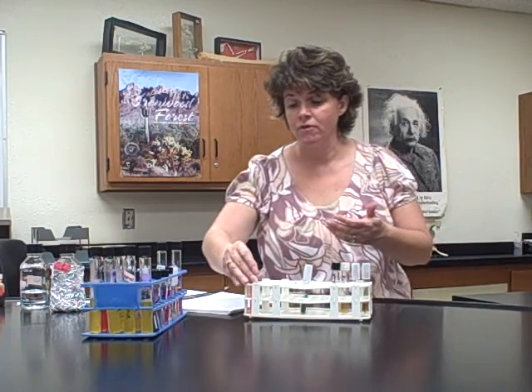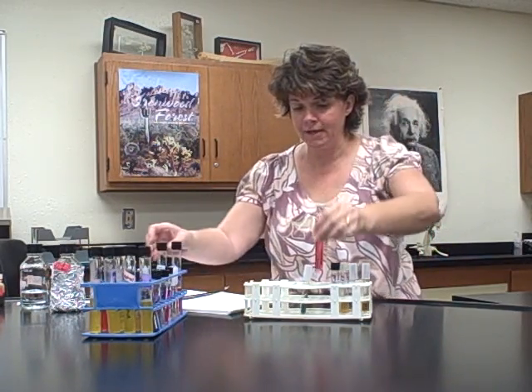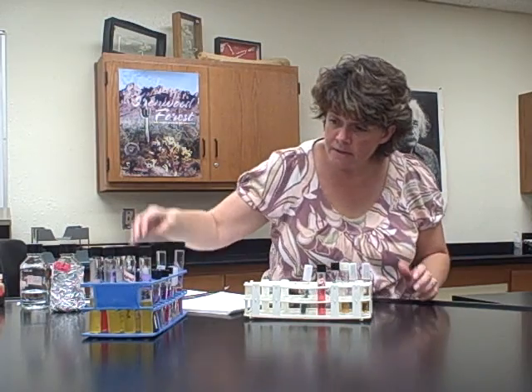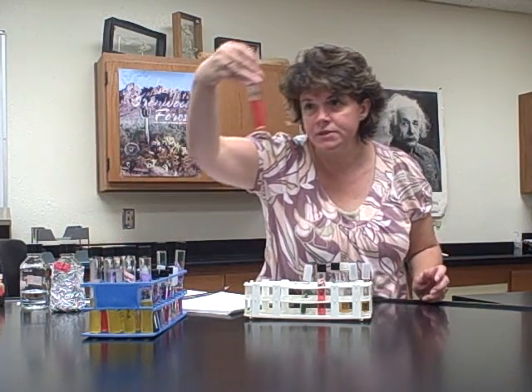If you see some sort of cloudiness, that means there was growth. Right here is an uninoculated tube. It's very clear, there's no growth in it. I pick up one of these, I can definitely see the cloudiness, so there's definitely growth. I don't particularly see any that did not, well, this one looks like it might not have grown.